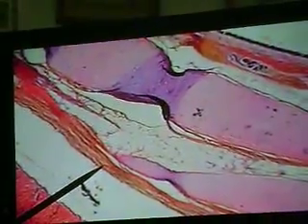So there we see the hyaline cartilage. Now there's a C-shaped hyaline cartilage coming right around here. Okay, that's the C-shaped hyaline cartilage going right around. There we're seeing bits of smooth muscle. Wait till we get there. Right here, it's smooth muscle. That smooth muscle is the trachealis muscle right here.